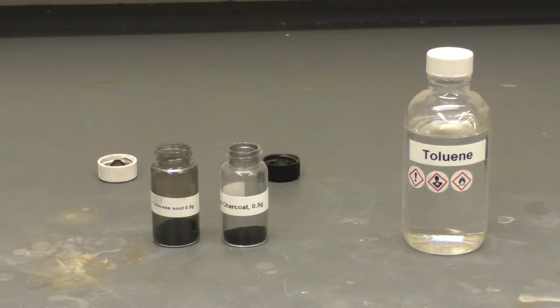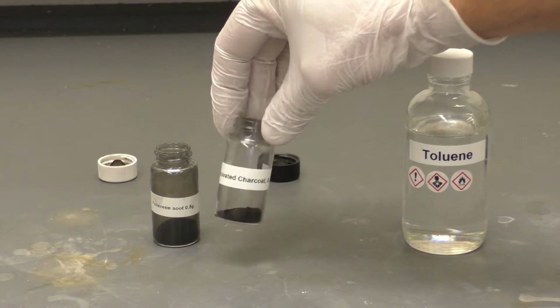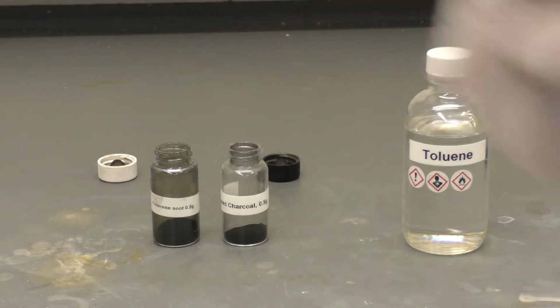I'm going to show you the extraction of Buckyball C60 and C70 into a solvent called toluene that you can see here. And we're going to compare that to if I took another sample of carbon, just charcoal that's ground up into a powder, so that we can see that there really is a difference. And so before we start, if we think about charcoal or anything like that, it's black.